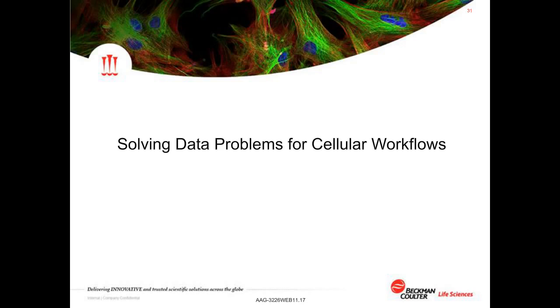I've been working with automation and with robotics and scheduling for over 20 years, and I can tell you that 20 years ago, the challenge was really about moving samples through a system, and sample handling was a big challenge. But today we would consider that mostly a solved problem. And so today's challenge, the more cutting edge, is to make sure that you're managing your data along with your samples, and that's really the impetus behind our talk about having two different layers of integration, both the sample management and now I'll go into the data management.